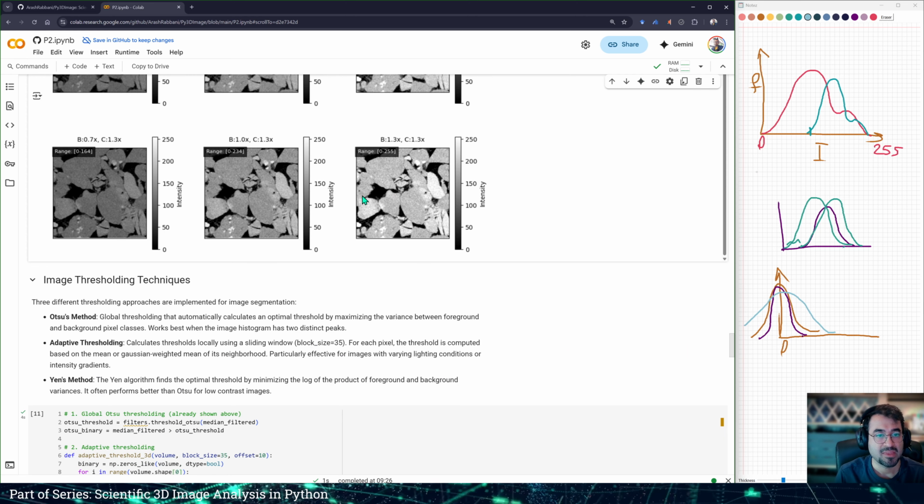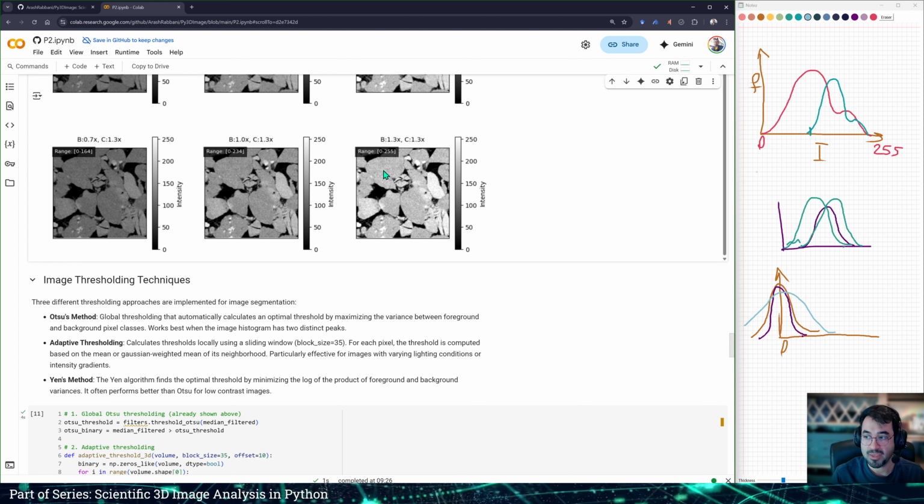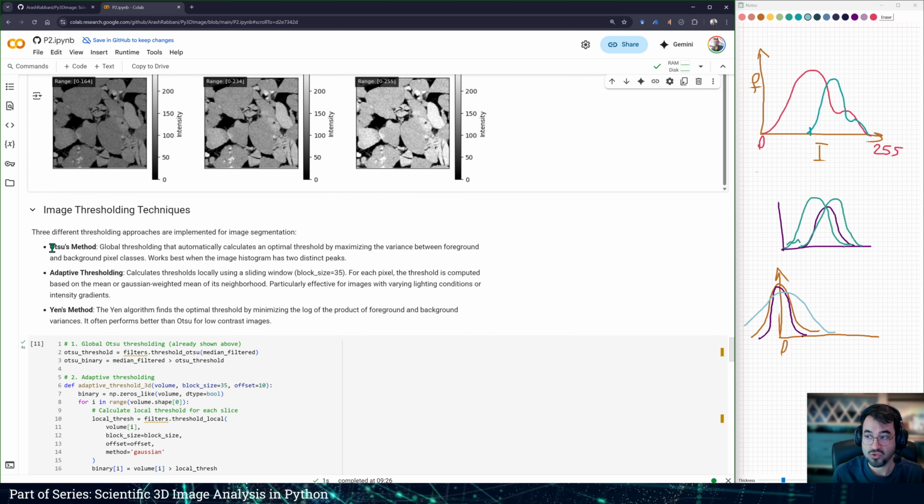So what we can do next is that we could distinguish between different regions of this image based on the color intensity. Thresholding is giving us a very simple way to divide this image into white and black pixels, right? Because you see we have some gray values going on as well. So if we wanted to draw a line between two different regions of this image, thresholding could come in handy, right? Sometimes you have an object in front of a background, and the background is not pitch black, so there's a little bit of gray going on, and you want to get rid of all the background. So thresholding could be a way to go, right? And we have different methods to do that. So we could do the Otsu algorithm.